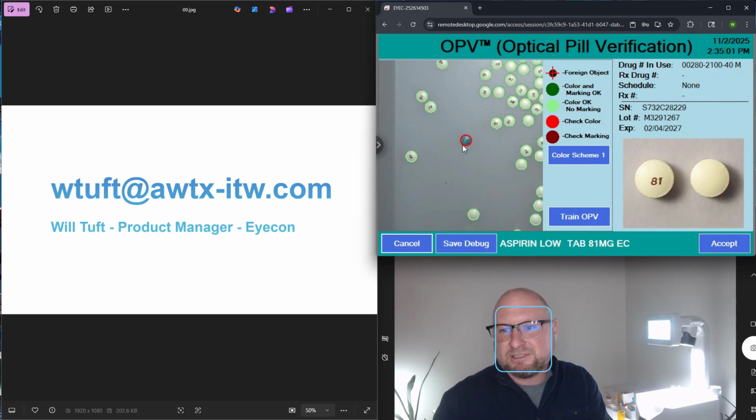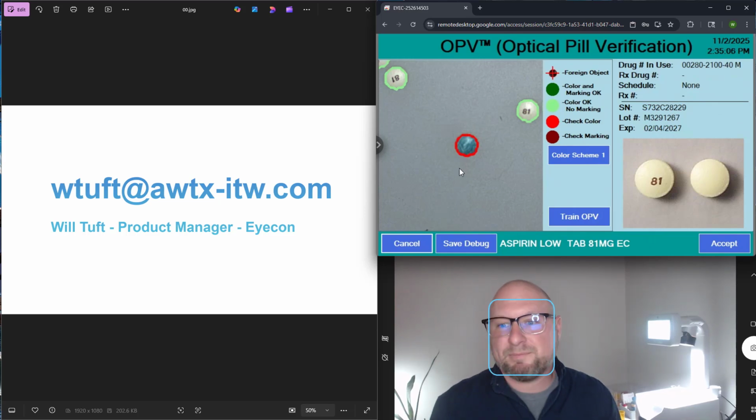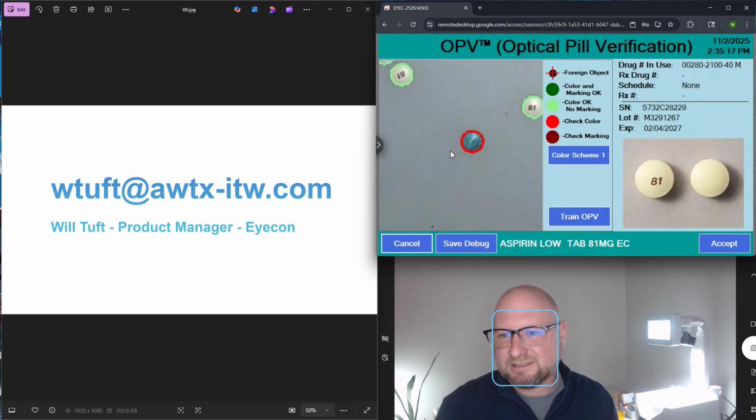So you may also notice just then when I double clicked, that's another improvement that we've made behind the scenes. Previously, if you double clicked, it would just zoom in and wasn't necessarily zooming in where you clicked. So another small improvement there that I'm really excited about.